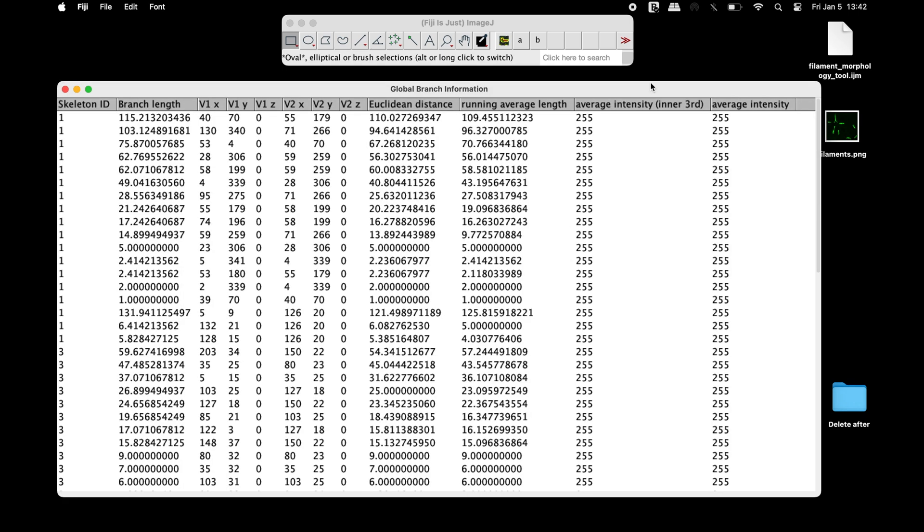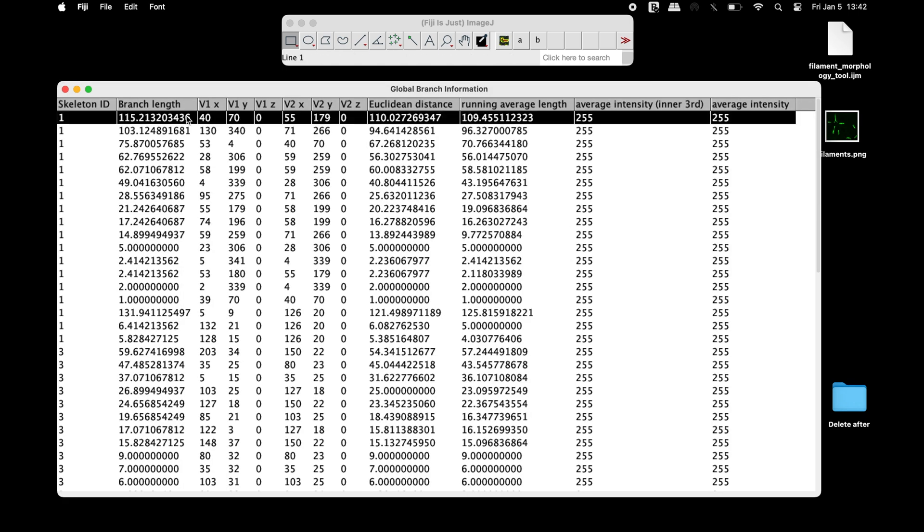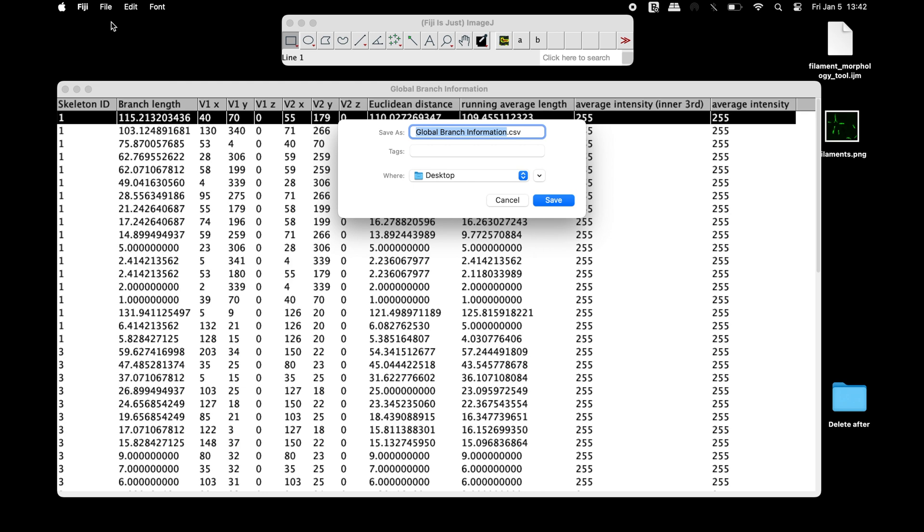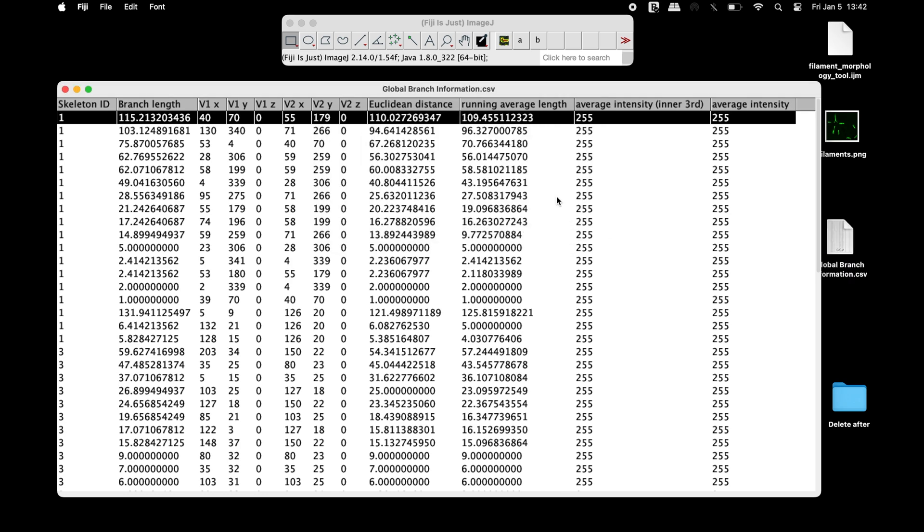In the global branch information window, results for branch length, Euclidean distance, and other information can be obtained. This information can be saved in a .csv file format.